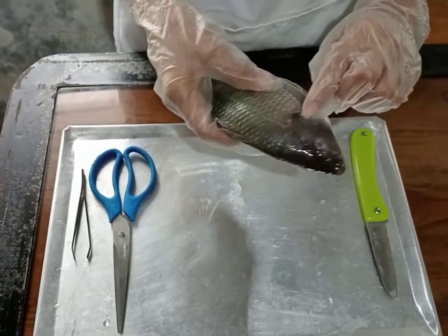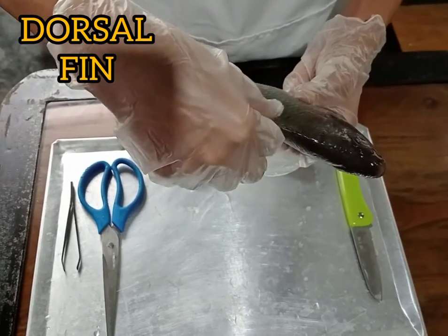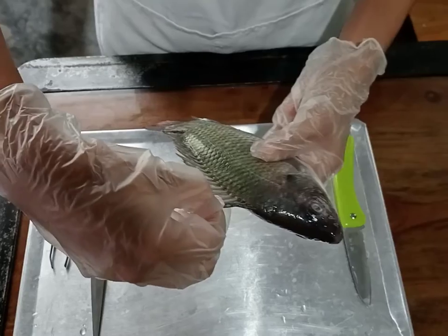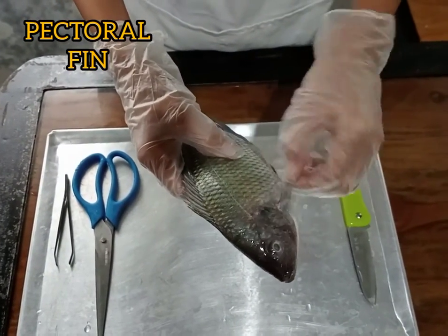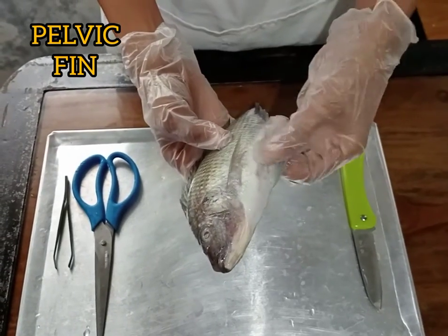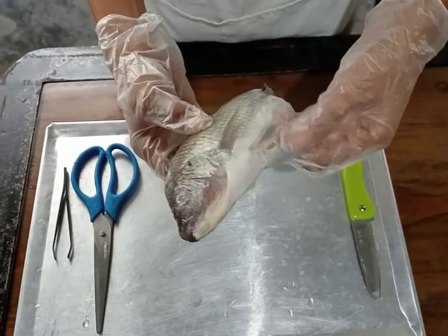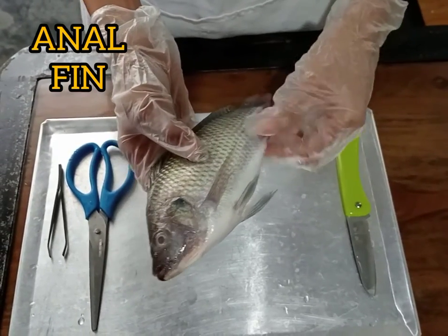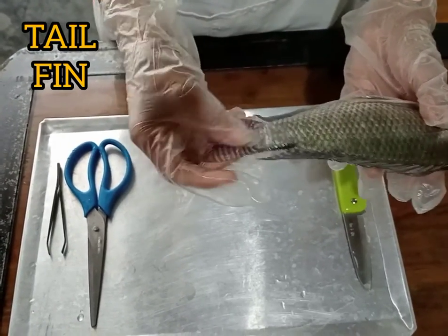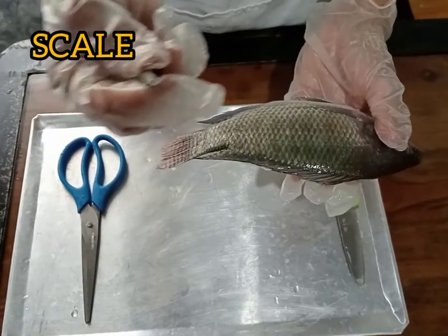We have here also the dorsal fin, the pectoral fin, and the pelvic fin. And we have here the anal fin, and the tail fin, and lastly, we have here the scale of the tilapia.